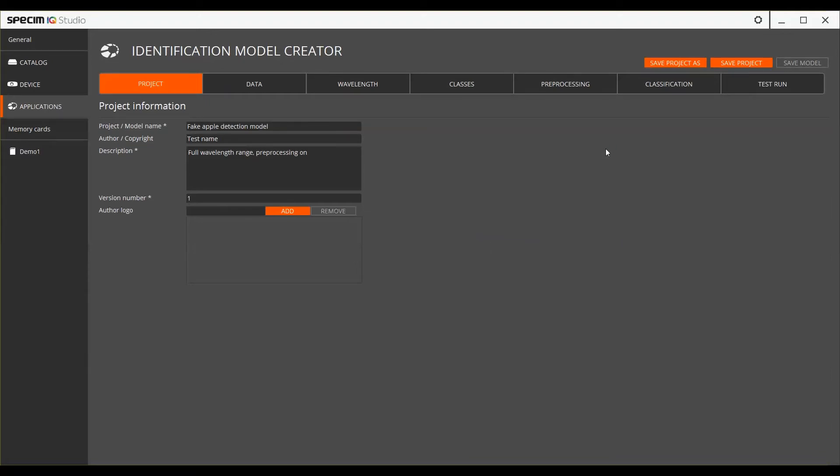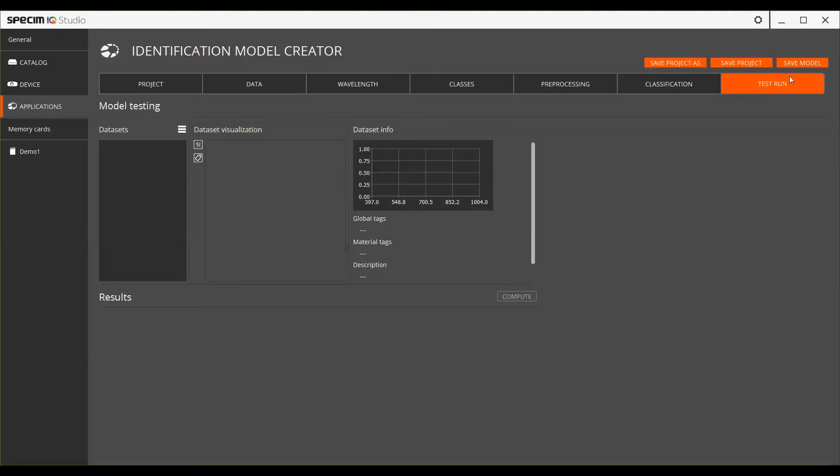This is the Identification Model Creator, the place where you can create models. The user goes through the workflow one tab at a time, starting with the Project tab and moving all the way down to the Test Run tab. This is where the model project can then be saved into an actual model.